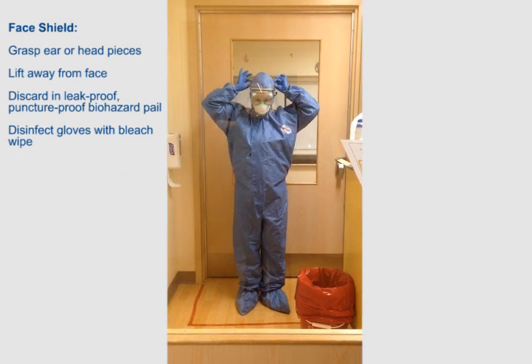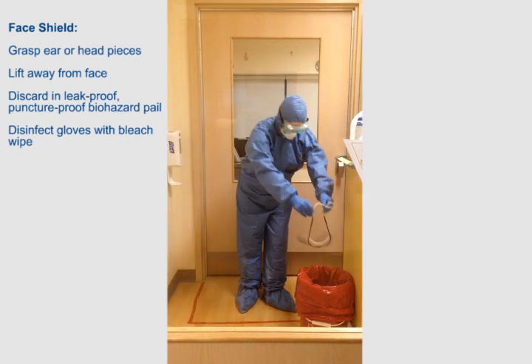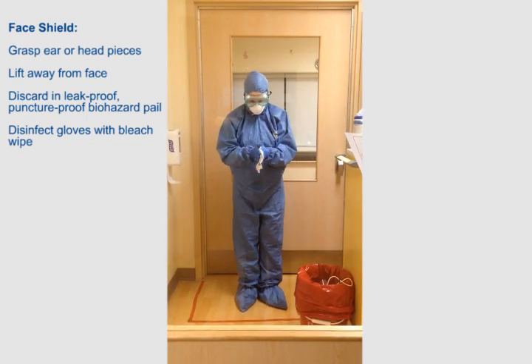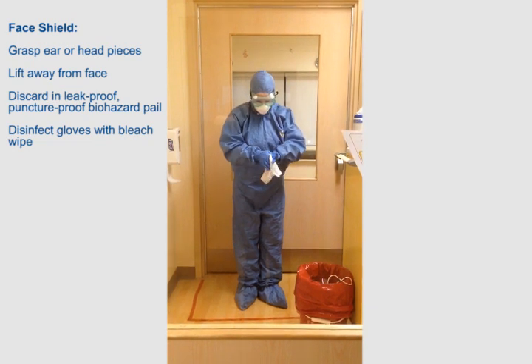Face shield. Grasp ear or head pieces. Lift away from face. Discard in leak-proof, puncture-proof biohazard pail. Disinfect gloves with bleach wipe.